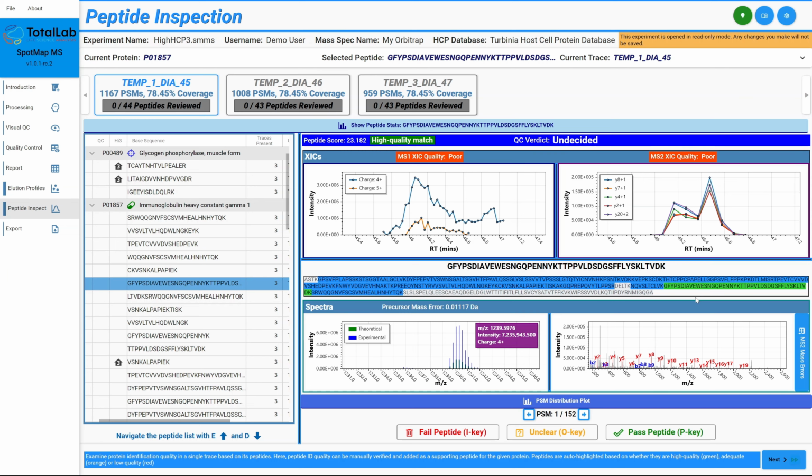So the problem we're trying to solve here is obviously host cell proteins can be present in your sample at vanishingly small amounts compared to your drug substance or other substances, yet even at those very small amounts they can have a very large impact. You can have 1 part per million of a host cell protein causing serious immunogenic or stability effects within your drug substance product. So we're really looking for very, very small signals and trying to be very sensitive about this because the things that we're trying to detect can potentially be very dangerous.